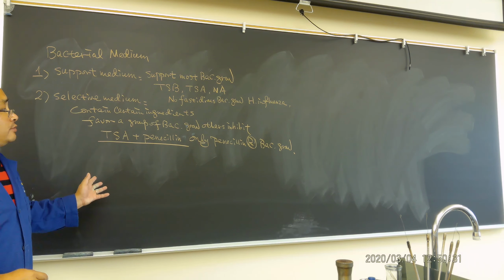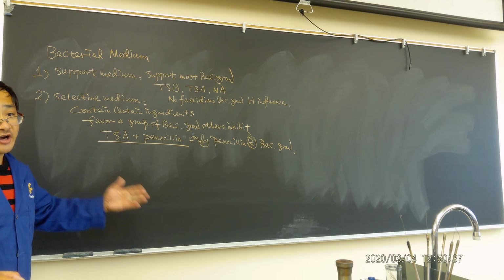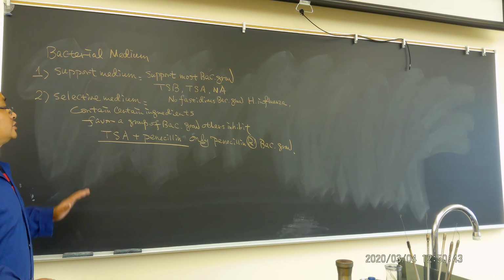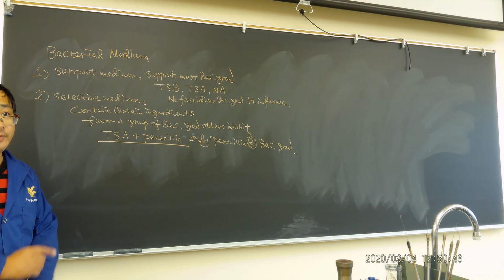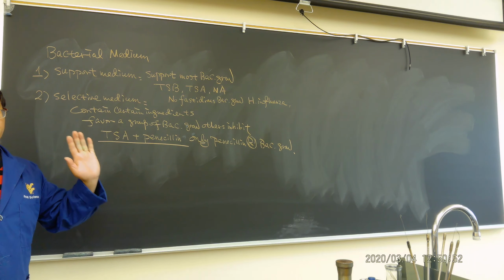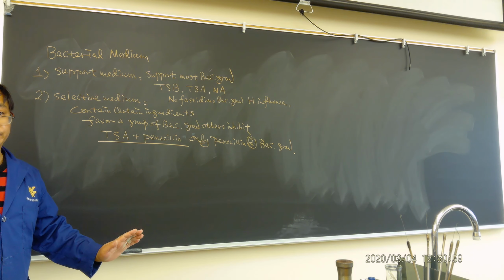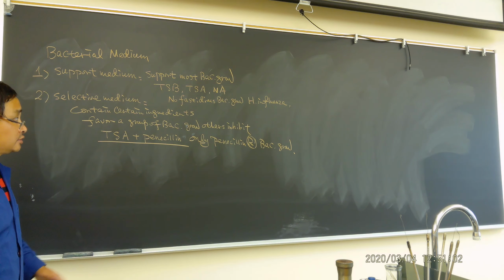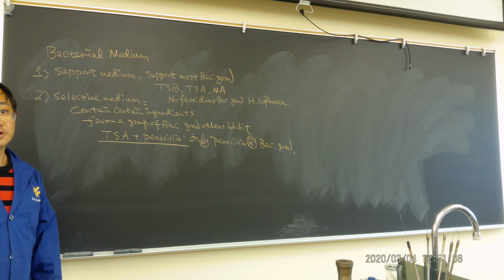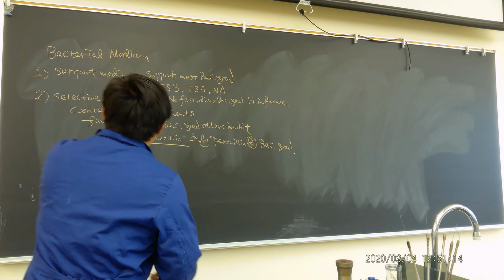Okay? But I have to be a little bit cautious. Selective medium is not that well defined, which means it's not absolutely selective. It does not mean only that bacteria will grow and other bacteria will not. The reason is, we only know 5% of the bacteria among the total bacteria in the world. There is 95% of bacteria we don't even know. So selective media is just a concept, it's relatively selective. It does not mean it's 100% selective, it's relative only, okay? So this is a good example for you.